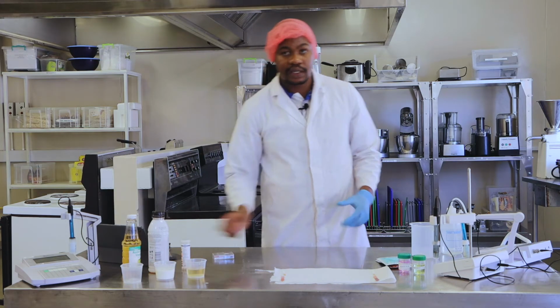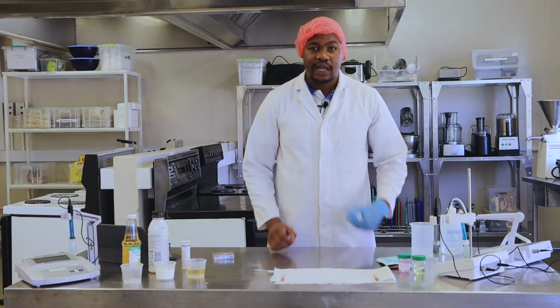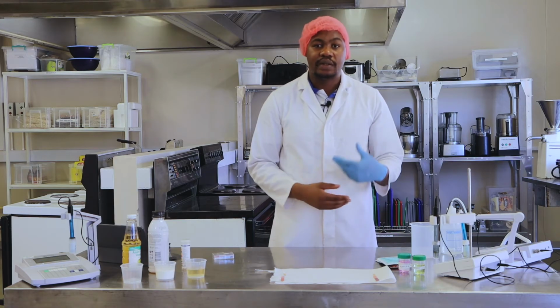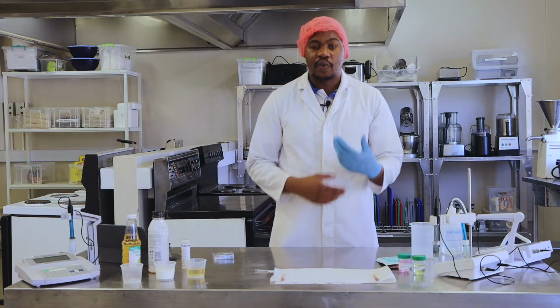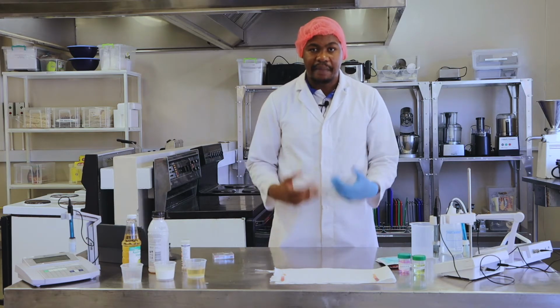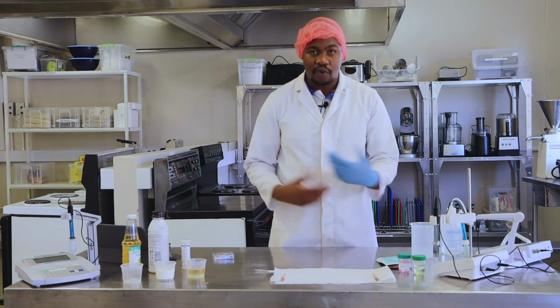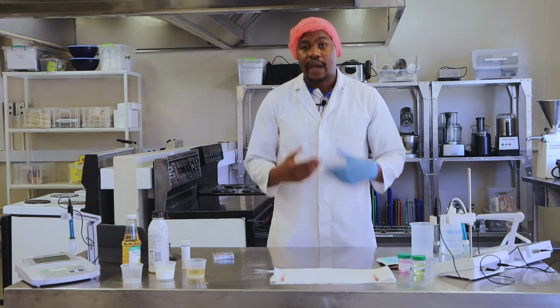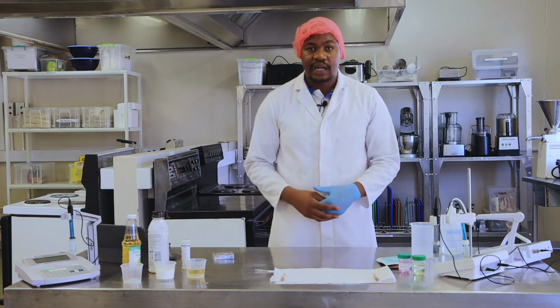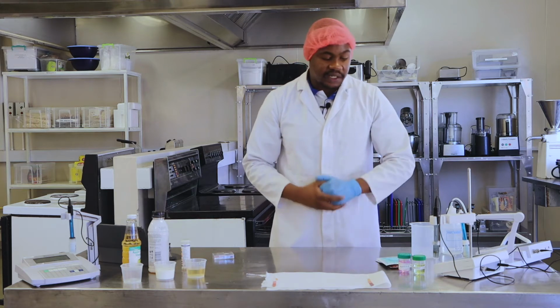Because in some cases the pH of milk will indicate that the milk is going to become sour, or turning into what we call amasi. Amasi is a product that has a low pH, which is acidic. In some cases it can indicate that the product has spoiled. So this is what I've done now, using the test strip.